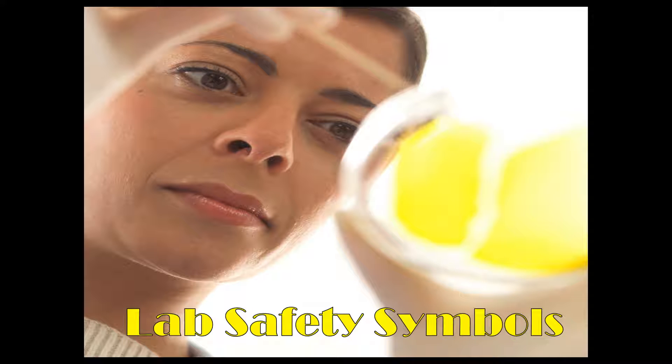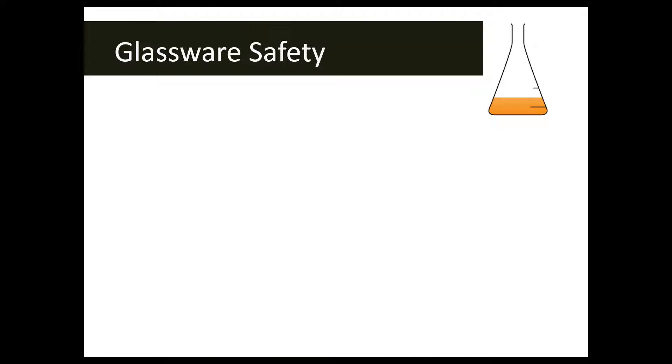Welcome back forensic students to today's lesson where we're talking all about lab safety symbols. This does not include all of the safety symbols that you might see this year in the classroom or in the lab, so your teacher will let you know if there are additional symbols other than the ones that we cover today. We're just going to go over some basics.